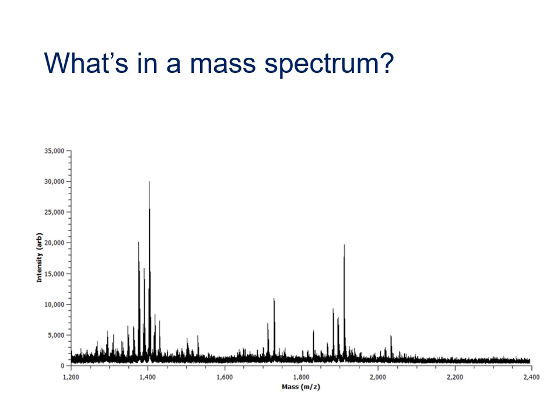As was discussed in the first session, one of the key outputs of any mass spectrometry analysis of a sample is likely to be a mass spectrum. So using this spectrum as an example, let's look at some of the key features. In the last session, we discussed the axes, the mass and intensity axes. Now we're going to begin to look at the spectrum itself.